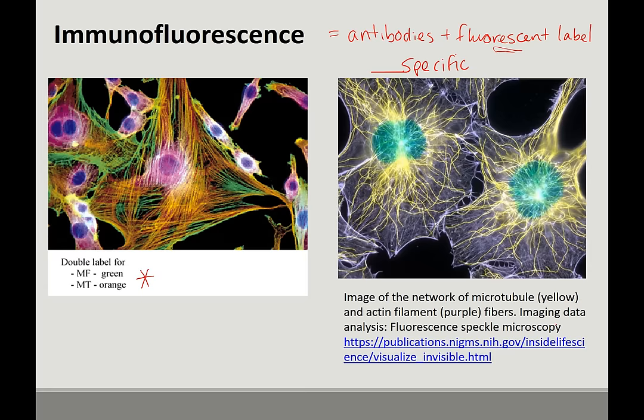This is using fluorescence speckle microscopy, and speckle microscopy, my understanding is with live, maybe I shouldn't have put it on this slide. Always interesting when you start lecturing. Anyways, I liked the image that was just showing you microtubules in yellow and the actin filaments in purple.